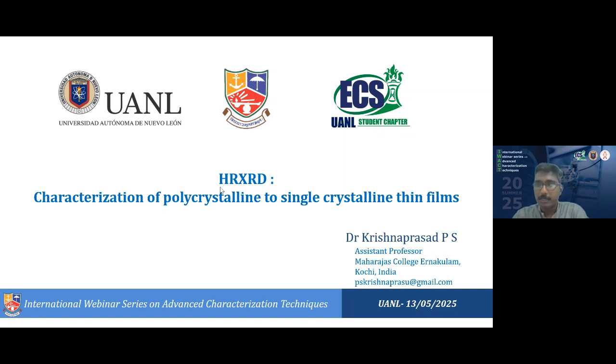HRXRD plays a very critical role in analyzing structural properties of thin films with very high precision. Whether you are studying epitaxial thin films, polycrystalline thin films, semiconductor wafers, or even multi-layered structures, it can provide great insights that are essential for both research as well as industry applications. With that short note, let us start exploring some of the basic theory and applications of HRXRD.